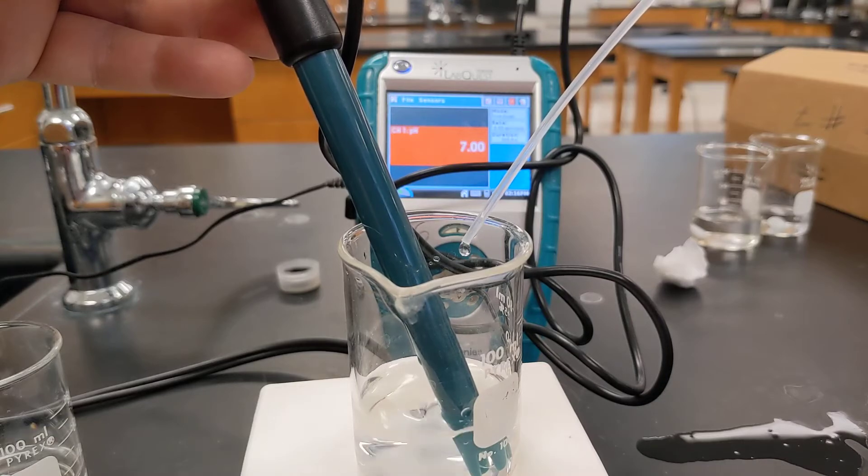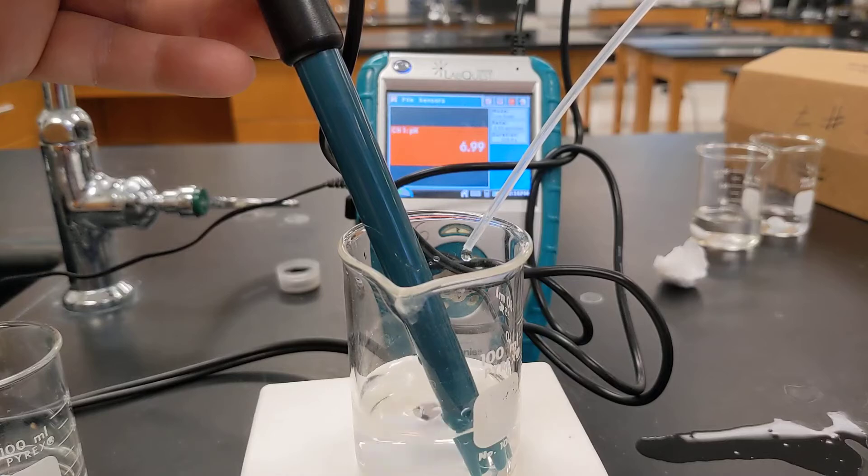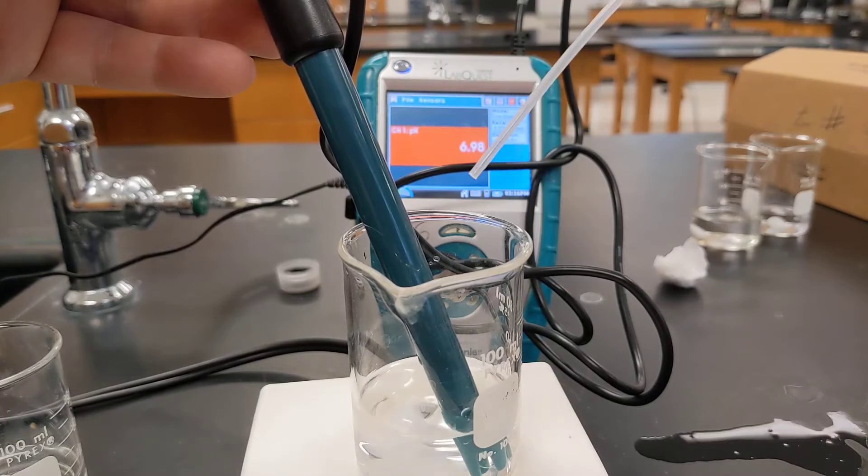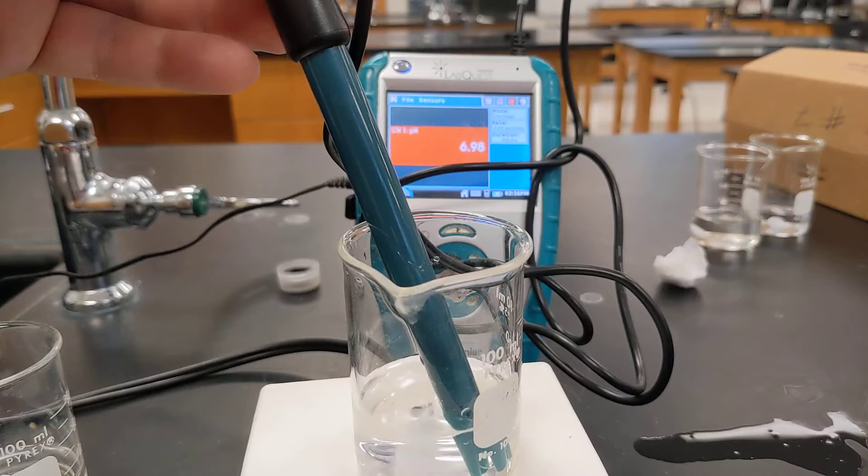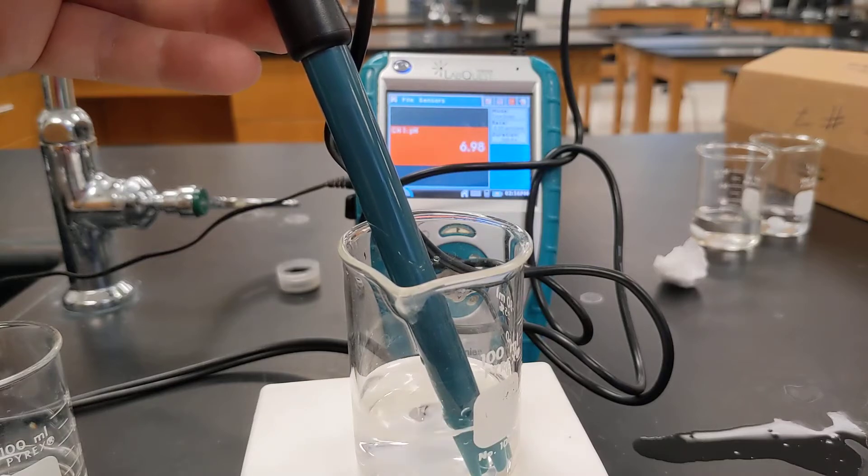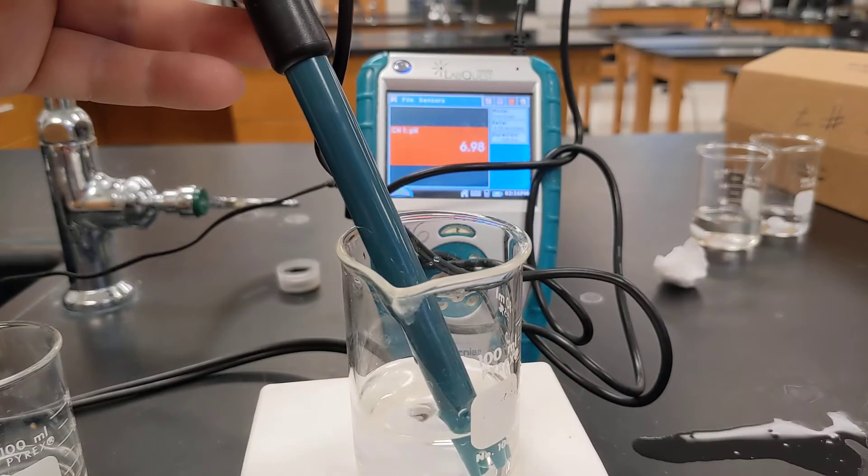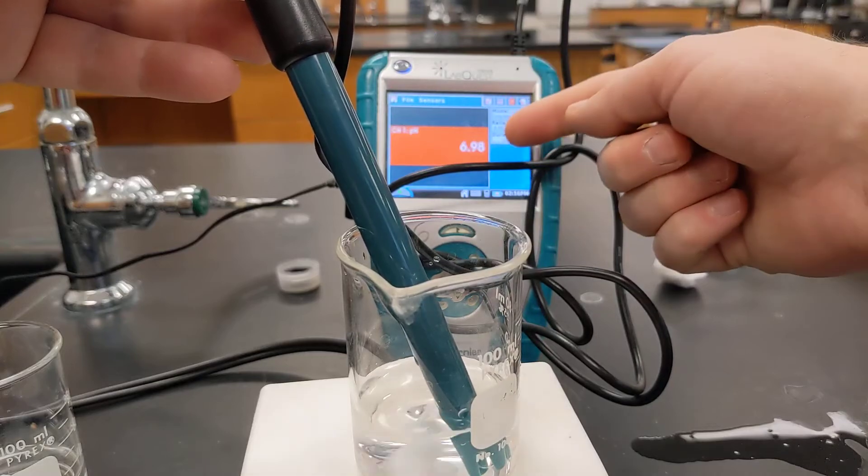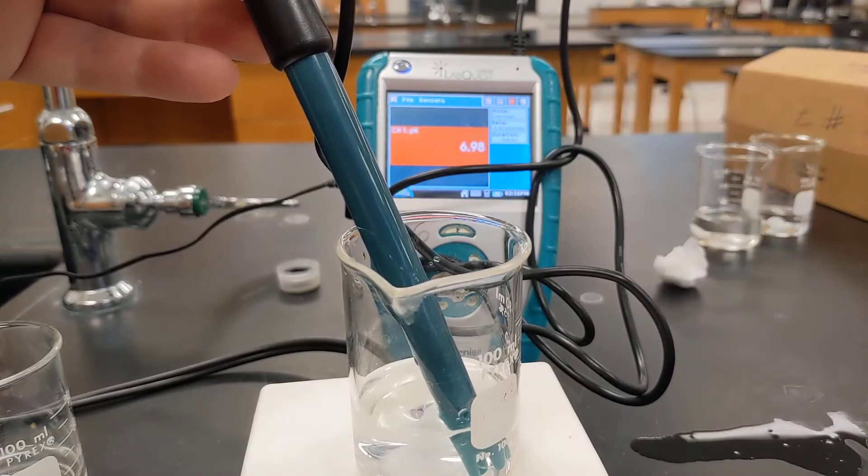Twenty-one, twenty-two, twenty-three, twenty-four, twenty-five, twenty-six, twenty-seven, twenty-eight, twenty-nine, thirty drops of hydrochloric acid, and the pH still six point nine eight. You can see it back here if the camera would focus on that.